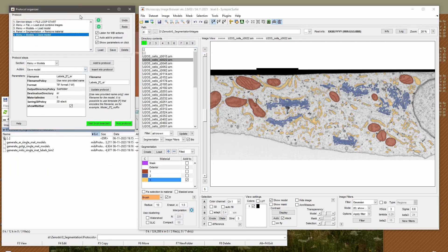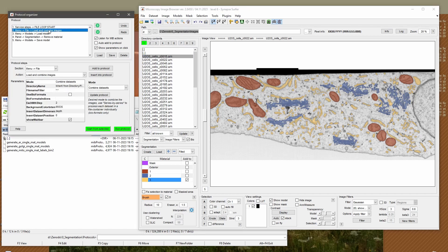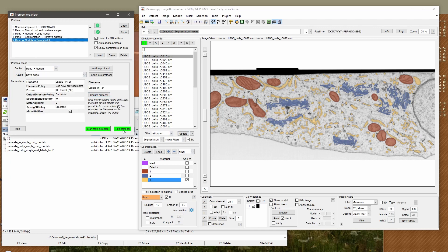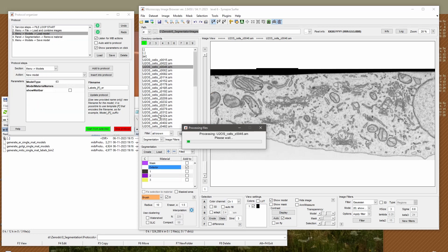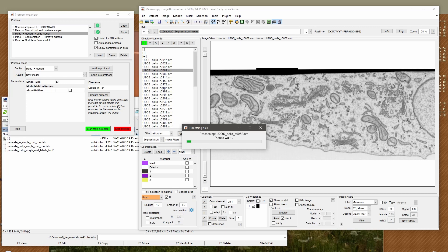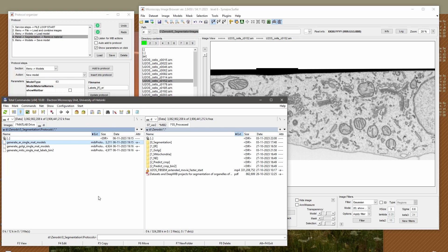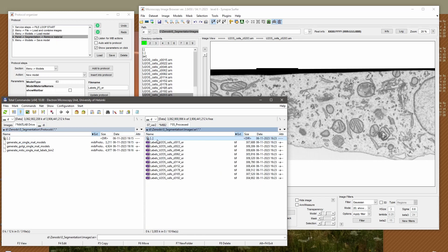The protocol has a list of operations. First, we need to be in the directory containing images. After that, the script loads each dataset one by one, removes materials which are not ER, and then saves the model. Let's see how it works — I press the Run Protocol button and the protocol goes file by file, loads the dataset, loads the corresponding labels, then extracts only the endoplasmic reticulum and saves it into the ER directory.